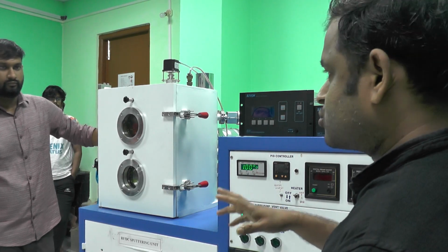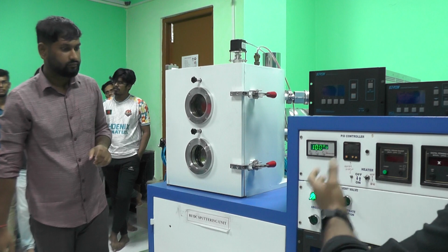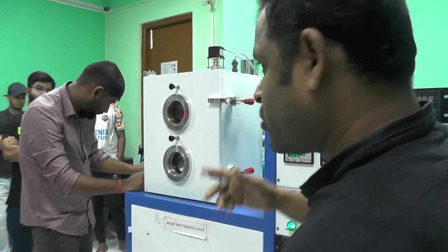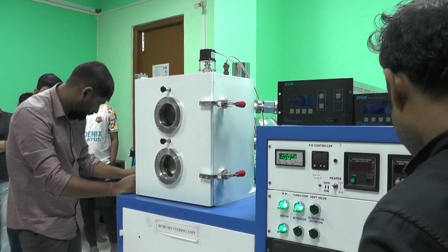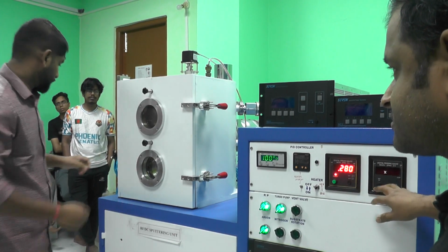Actually, due to time constraints we can't show it from the beginning. We had turned on our system prior, 4 hours ago. Now we can show you the deposition process.